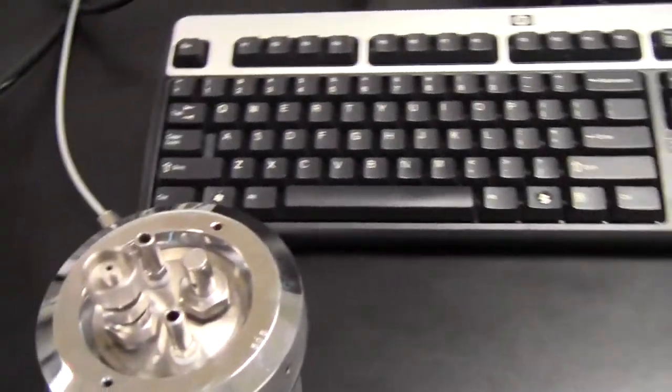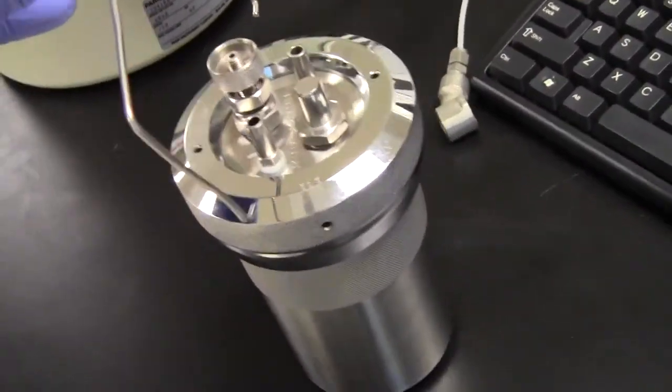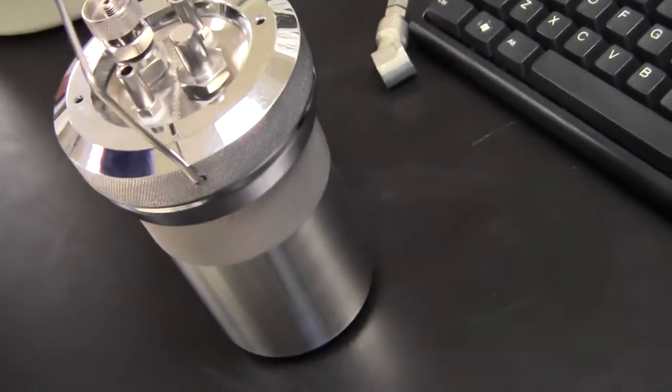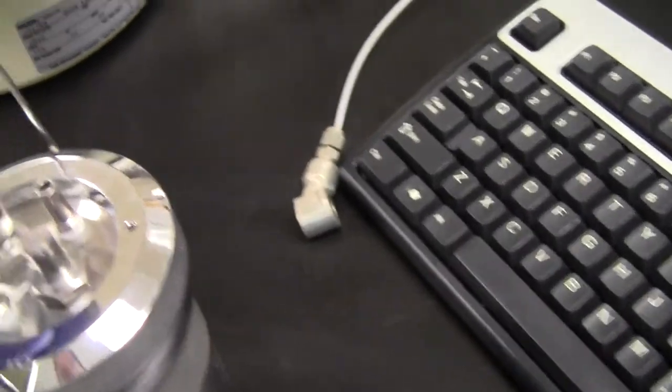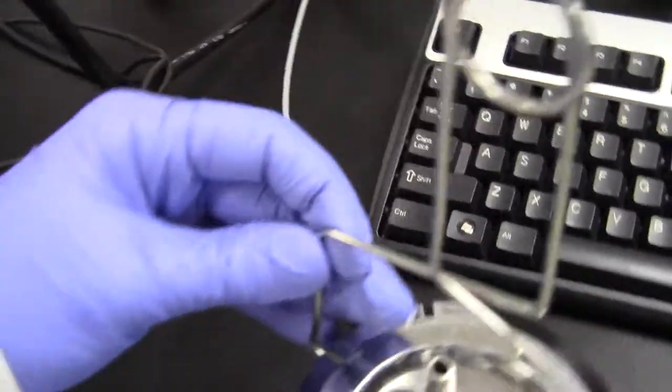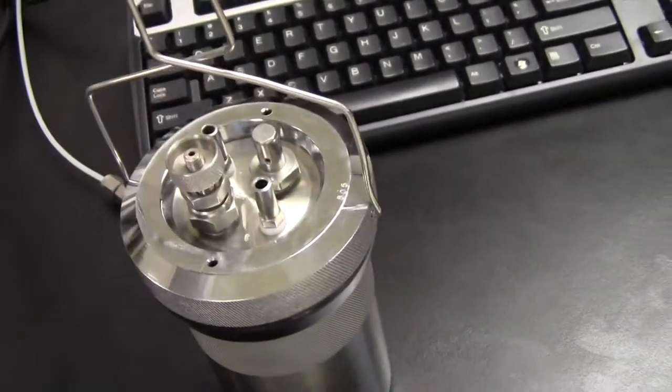And then we'll use our tweezers. See that little hole on the side? So these are not tweezers but tongs, that are special tongs just for the bomb, and we'll lift that up.